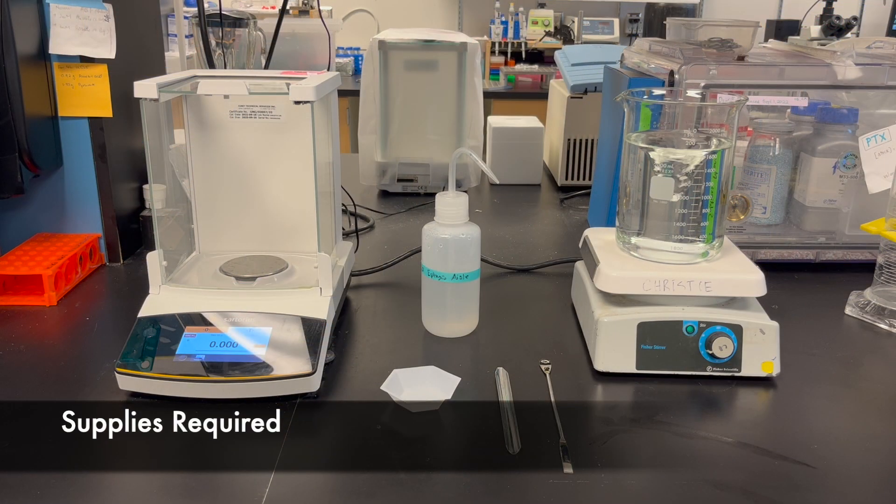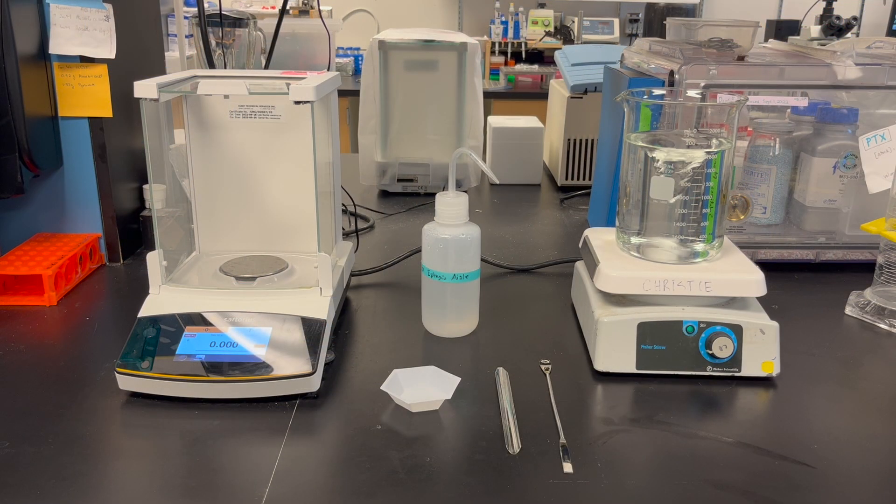You will need a scale, weigh boats, weighing utensils, a squeeze bottle containing deionized water, a beaker that is only partway filled with deionized water, a stir plate, and a stir bar.